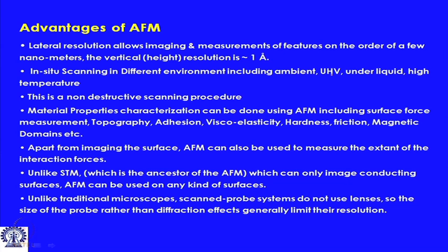Apart from imaging the surface, as we have already talked, AFM can also be used to measure or quantify the interaction forces between two surfaces. So, one can look at the interaction forces between identical surfaces or dissimilar surfaces by using colloidal probes, which are preferred tools for measuring the interaction force for an AFM between two surfaces.